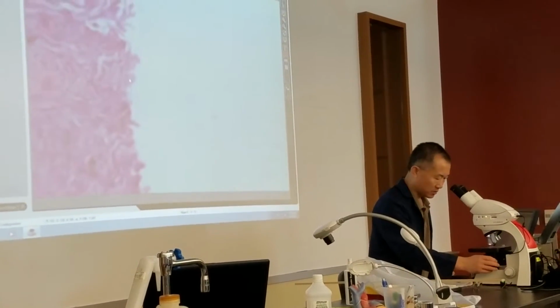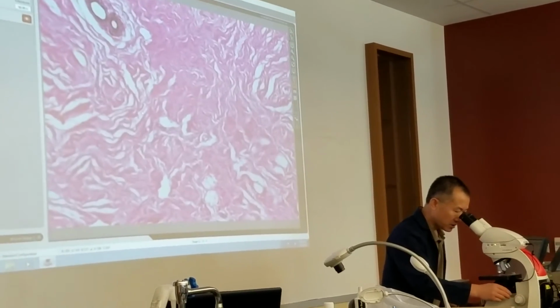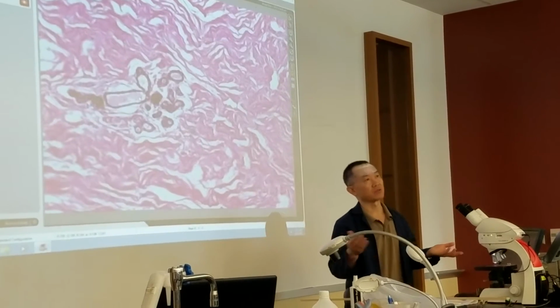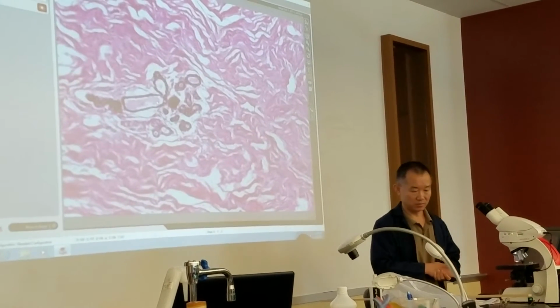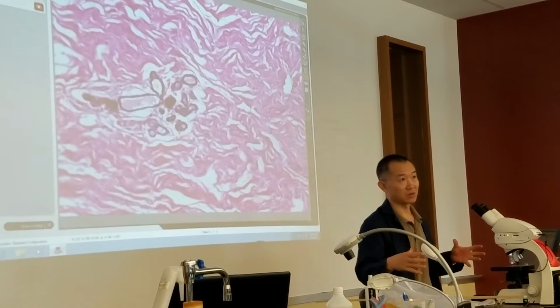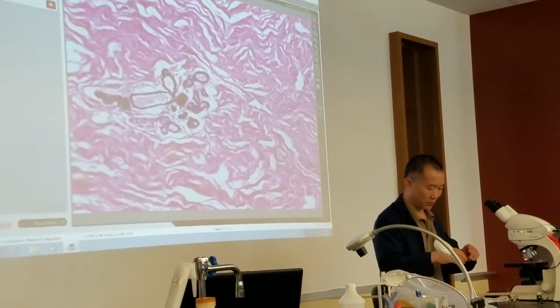Lactating mammary glands. Okay. Resting and lactating. So this one is quite easy, right? For the resting mammary glands, you see the lobules. Around the lobules there is a lot of connective tissue. And for the lactating mammary glands, you just see swelling. Lobules connecting to the next lobules, and the lactiferous duct is full of secretion.